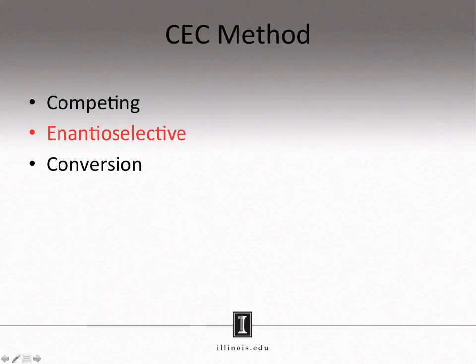We have finished discussing the competing portion of a CEC experiment. Now let us discuss the enantioselective portion.